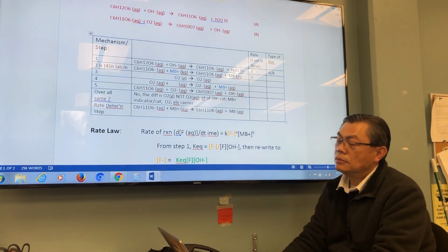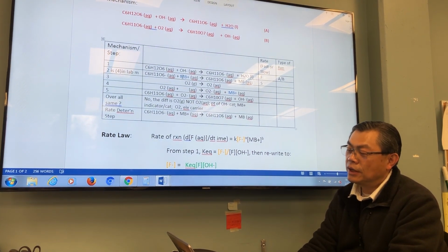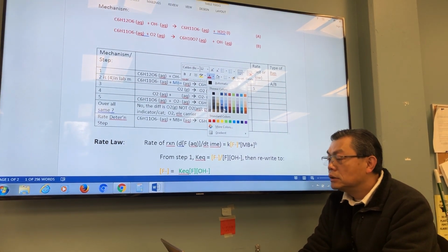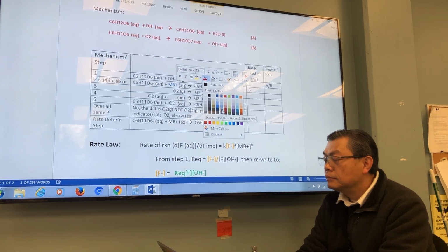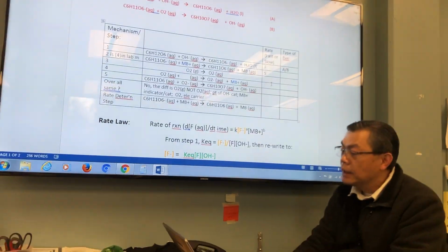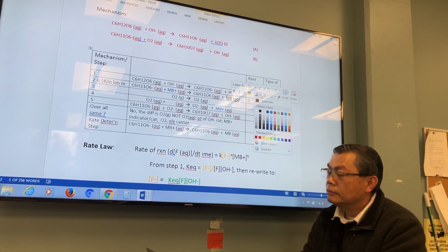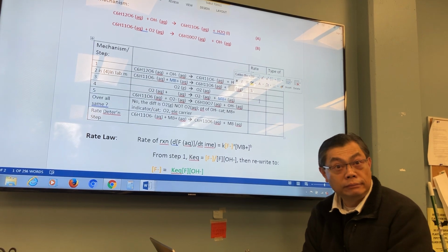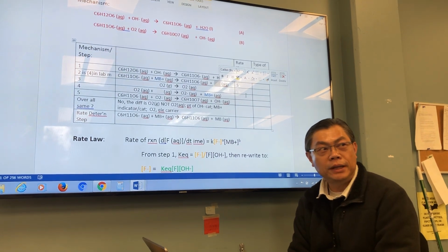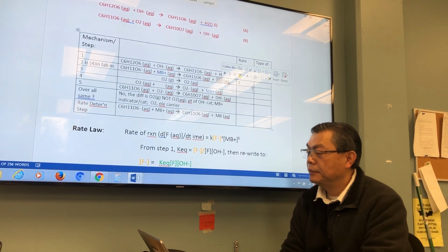How do you know? Because your methylene blue plus, what color is your methylene blue plus? Was it blue like this? So it was blue, yes? What color is your MP? No color. So we've been timing from blue to clear, yes? Why have we been timing that? Because it's slow. That's why we can time it.